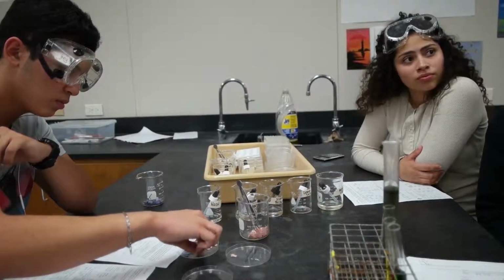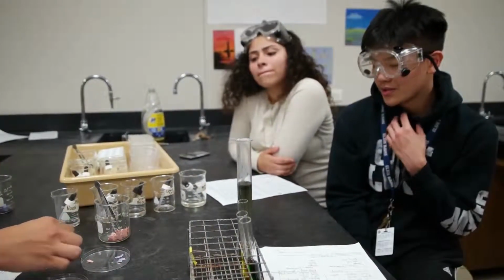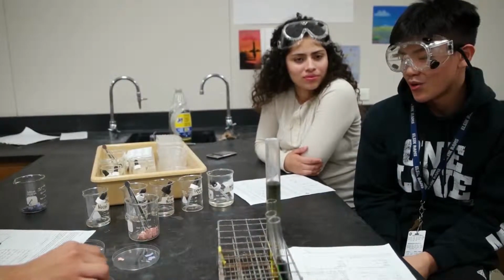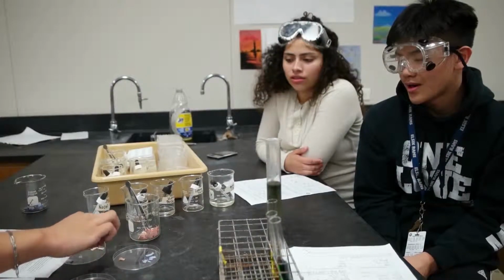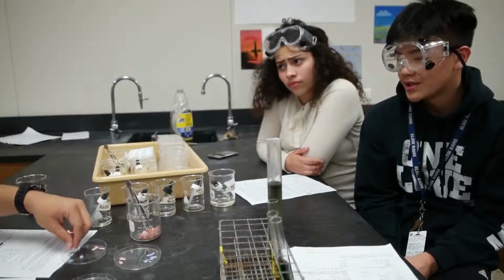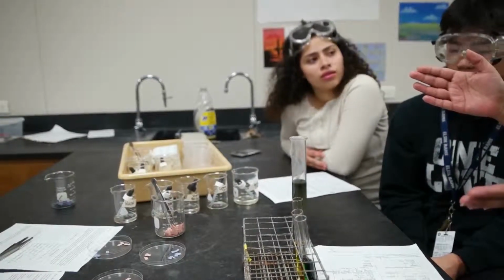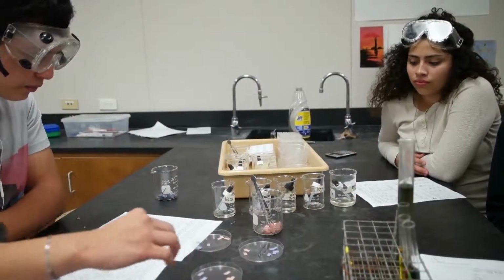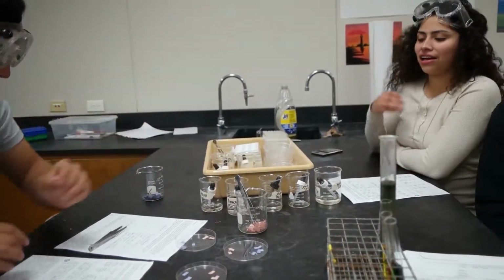Do you remember what the litmus paper is for? Yes, it was the key to determine which chemical was an acid or a base. Why test them both? Because by testing them both, better accuracy. Yes. Okay, so if one gives you a positive, the other would have to give you a negative. Yes. Okay, why don't you show us how it works? Okay. Pick a chemical. Which one do you want to pick? Let's go ahead with the.